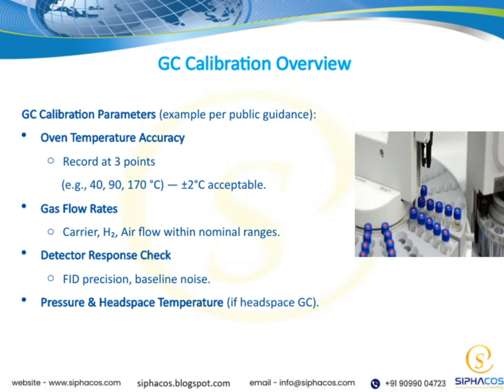Then there's the detector response check. Specifically, for the flame ionization detector, or FID, we need to verify both the precision of the response and the baseline noise level. This helps us confirm that the detector is operating reliably.